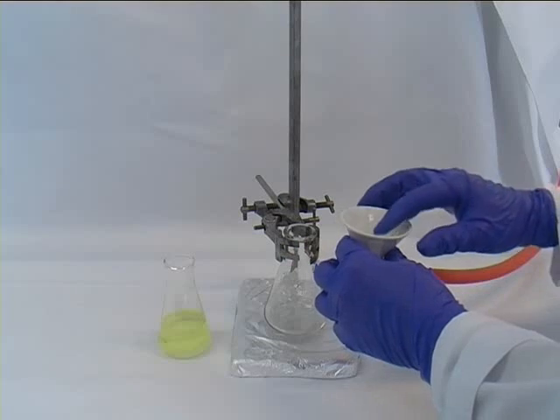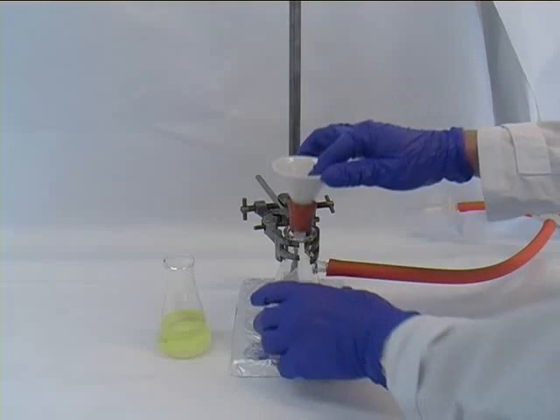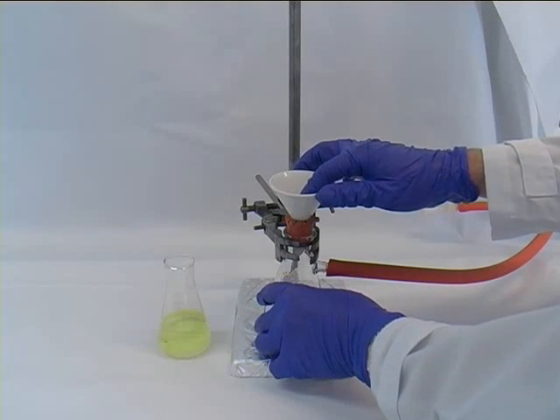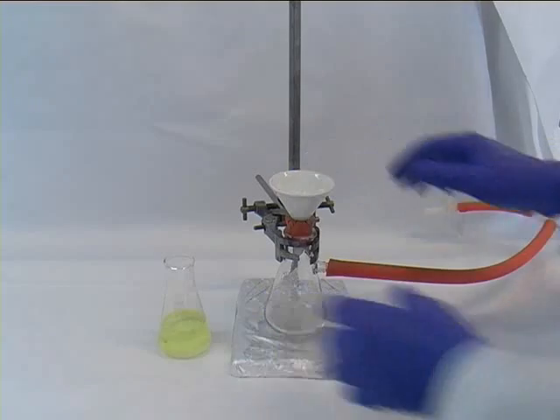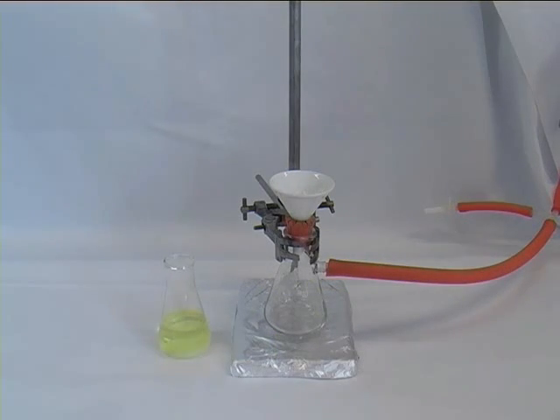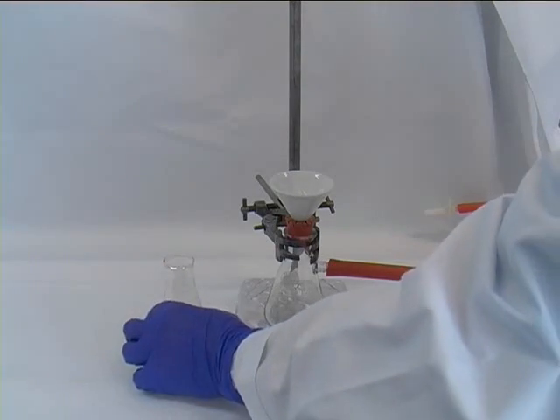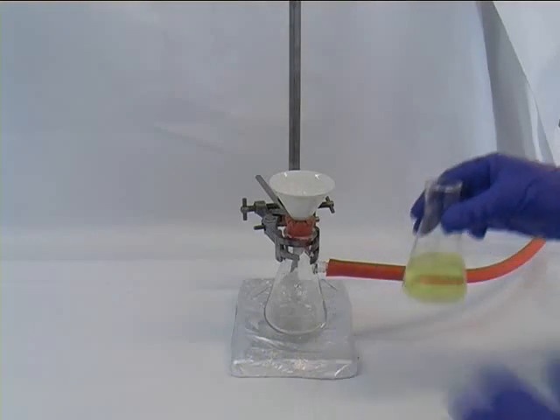We put that into the Hirsch funnel and the whole funnel on top of the Buchner flask. So at that point you would be switching on the vacuum which is the gray tab. Turn that on fully and then take your suspension.